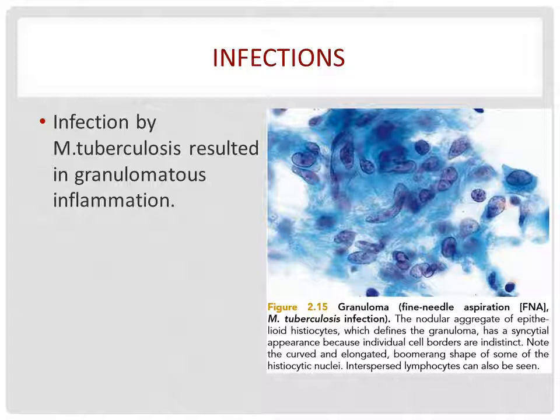The cells may also play an important role in diagnosing infectious disease. For example, tuberculosis, as shown in the image. Infection by Mycobacterium tuberculosis commonly results in granulomatous inflammation. The specimen shows aggregation of epithelioid histiocytes, which has a syncytial appearance because individual cell borders are indistinct.